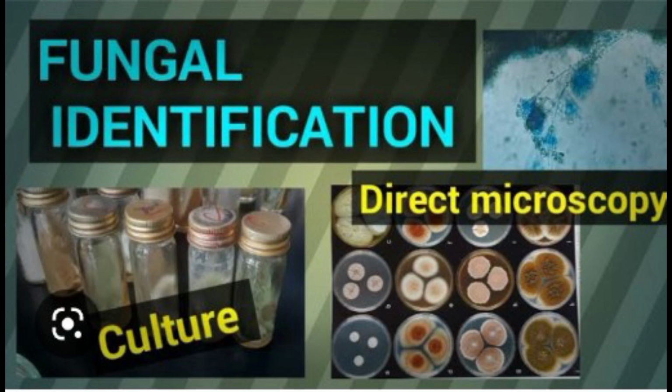Also needed: sterile scalpel blade, bacteriological wire loop, forceps, lactophenol cotton blue stain, and a microscope. Procedure: with the help of a sterile scalpel blade, cut out a 1 square centimeter block of Sabouraud dextrose agar from the petri dish. Place the agar block in the center of the glass slide in the slide culture set. Using a sterile bacteriological wire loop, inoculate 3 to 4 fragments of mold around the periphery of the agar block.